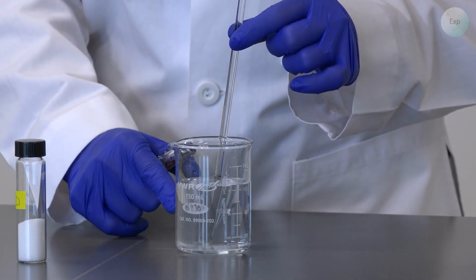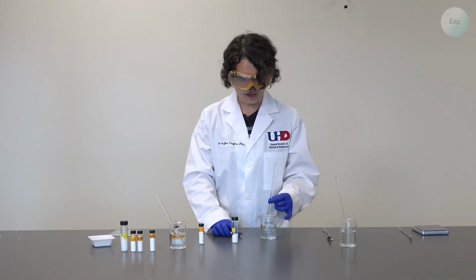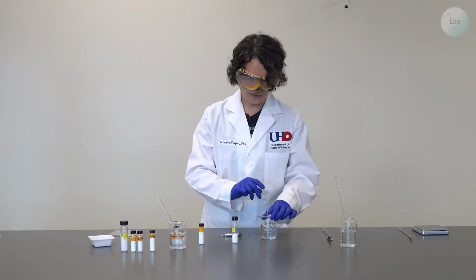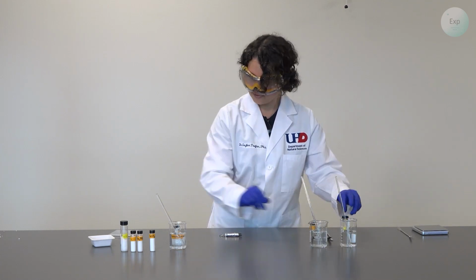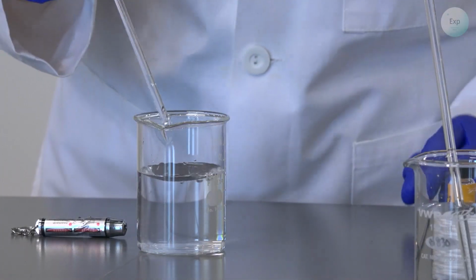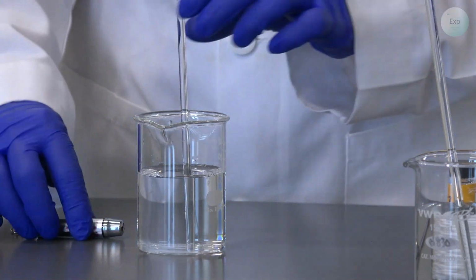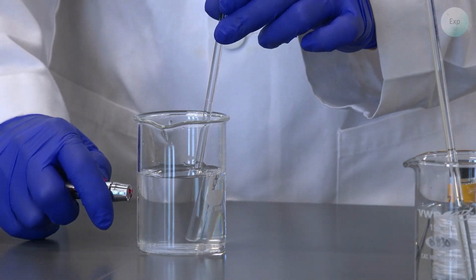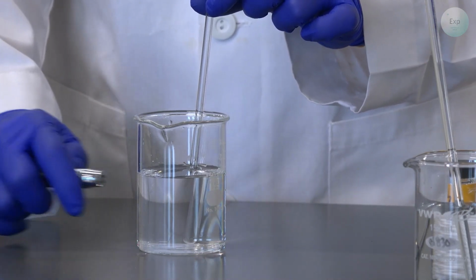There is a red dot at the entrance and at the exit of the solution, but not a beam across it. So we made another solution. And finally, our magnesium chloride solution. We stir it well. The solution appears clear. There aren't any magnesium chloride particles on the bottom, and we can check for the Tyndall effect, and we don't see the laser beam's path even in this case.